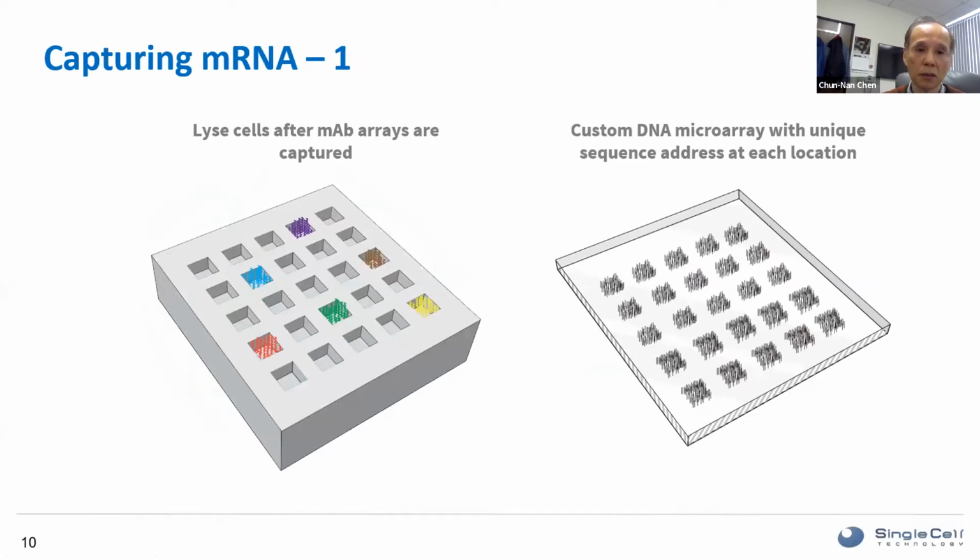And this is the third part that is capturing the mRNA. And in fact, this is the paired heavy chain light chain mRNA from each one of the cells. We are not capturing the transcriptome. We are mainly targeting the heavy chain light chain from these individual plasma cells.